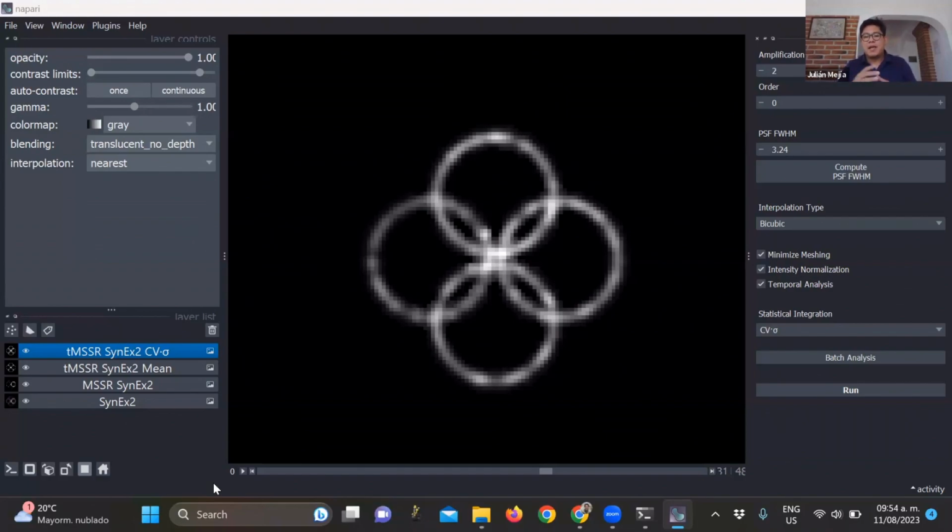It's like in the sense that I mentioned here with the 4 circles intersecting each other. Of course, we were expecting to observe these intersections, but in the other approaches we couldn't see them. So you have to have really clear what you expect, even though you haven't seen it before. And eventually we will include SQUIRREL or another kind of approach to try to automatically benchmark the denoising or the bias that you might induce with these methods. Yes, thanks for the question.